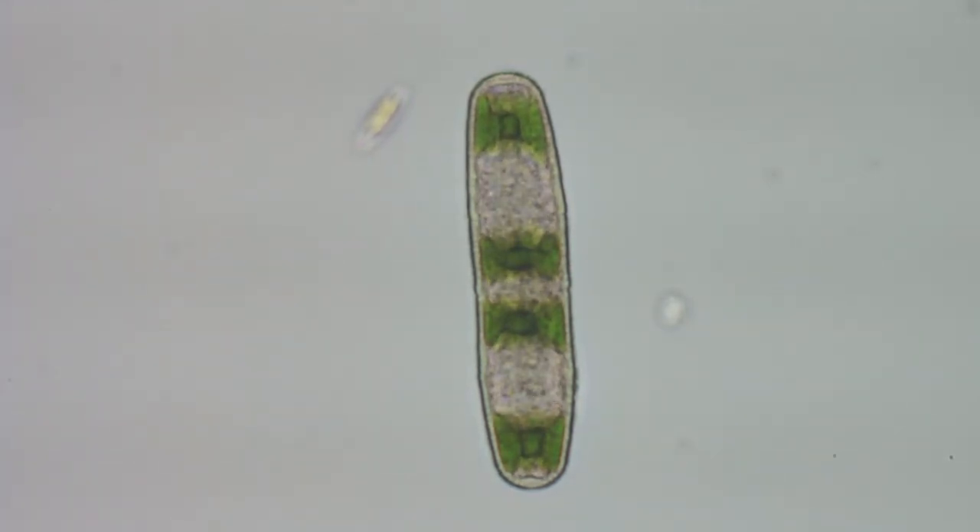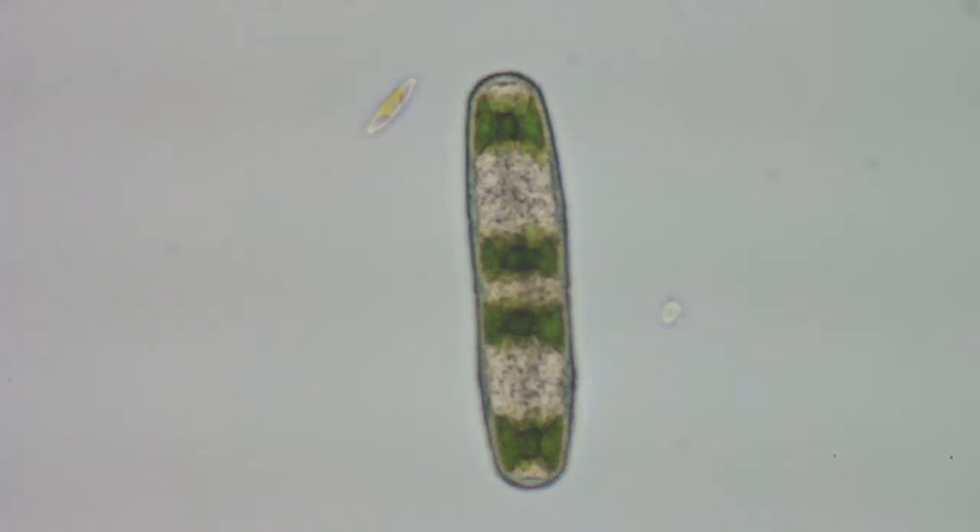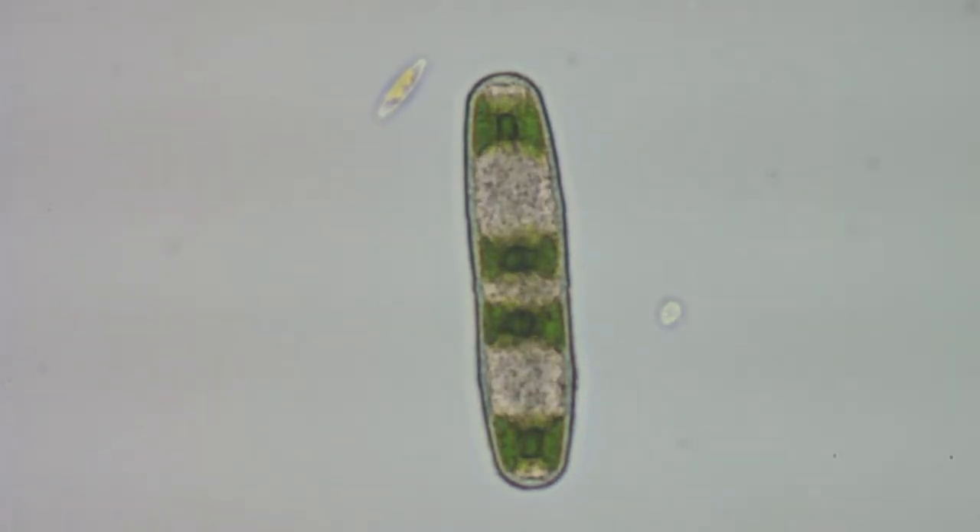Either this is the largest diatom I've ever seen, or it's a Desmid, because you can see up there at the top left of this guy — that's a diatom for sure. I'm using a Nikon 40x plan Achromat lens here on a Nikon Fluophot scope with a Canon T1i camera in video mode to record this.